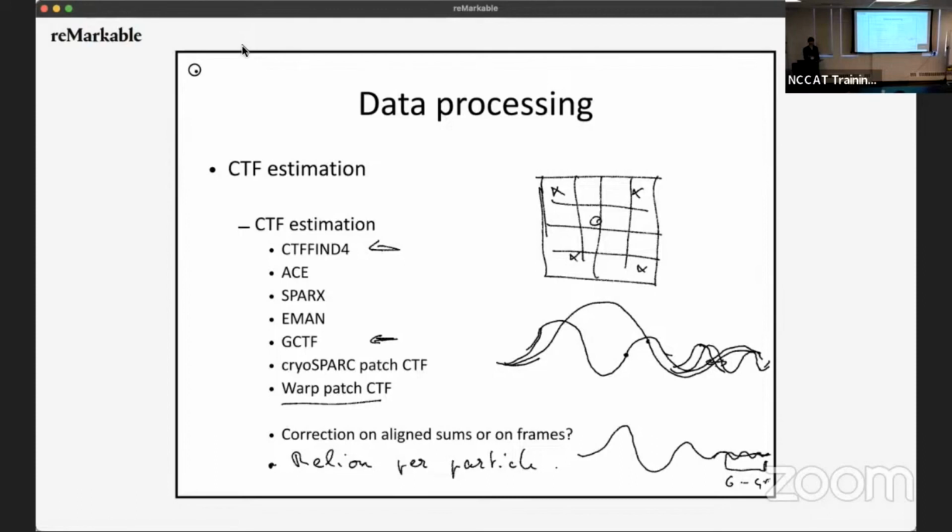And so that seems to be working, and therefore, why should I be collecting anything beyond 1.5 micron if I can get good reconstructions at 1.5 and lower? I don't know. It's still very empirical.